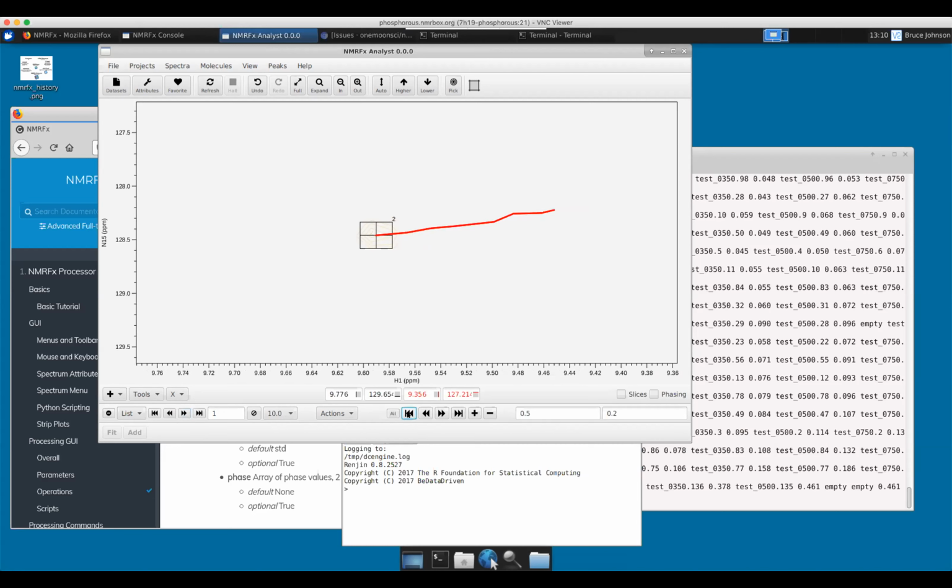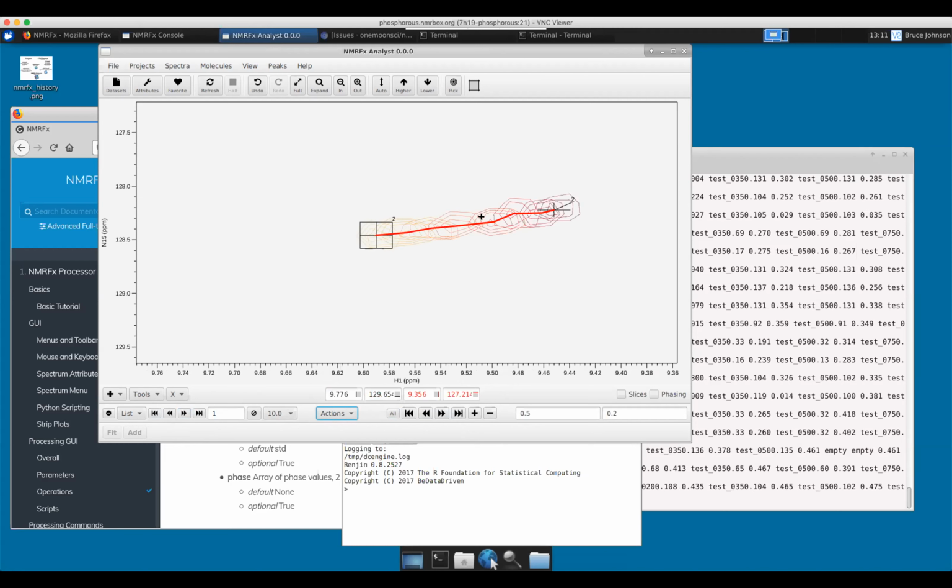And I can control which peaks are actually displayed. Sometimes there are so many in a path that this lets us step through individual data sets and actually see the peak and the actual experiment on that peak. These pluses and minuses, I won't have a chance to demo, they're kind of new. If you're missing a peak, you could go in and add a peak into that path explicitly. So I did paths, I've extended paths. That's another way to get more paths.